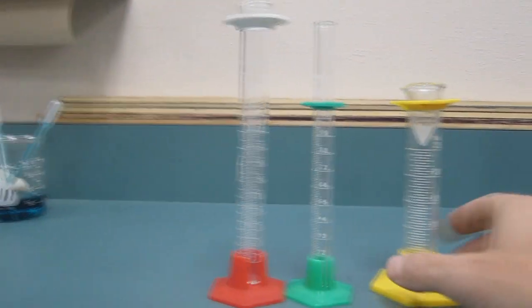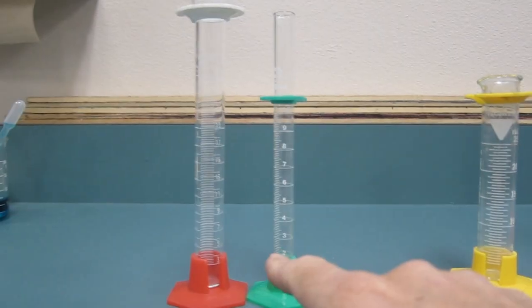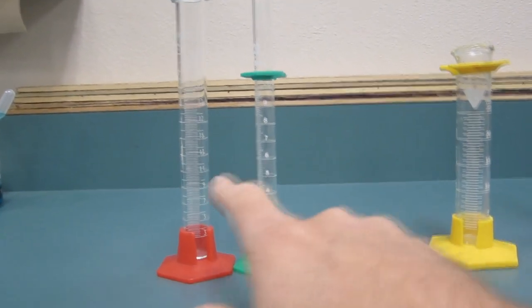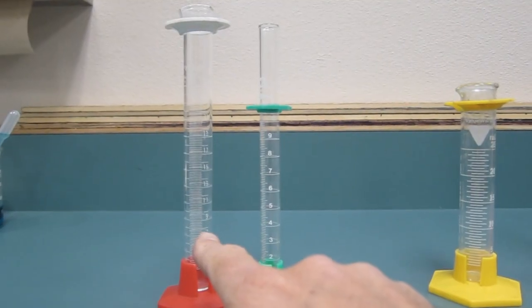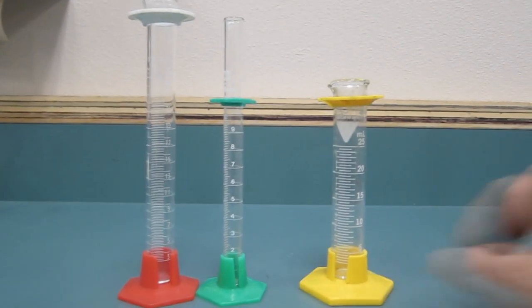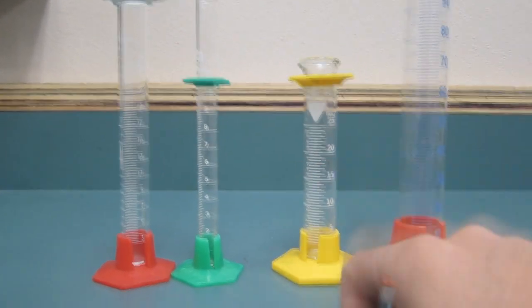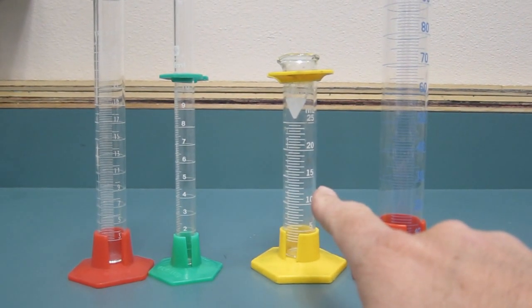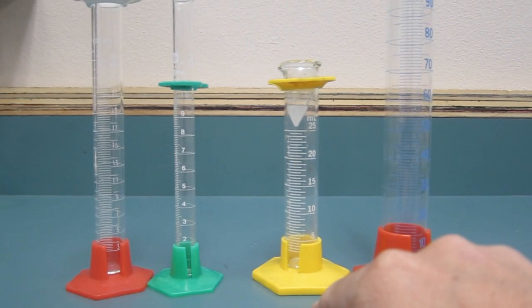But in addition to that, these over here measure even more accurately. These are a 10 milliliter one and a skinny 25 milliliter one. You need to know the scale on each one. Don't forget you measure from the bottom of the curved water line or the meniscus. And the biggest mistake is not getting eye level.